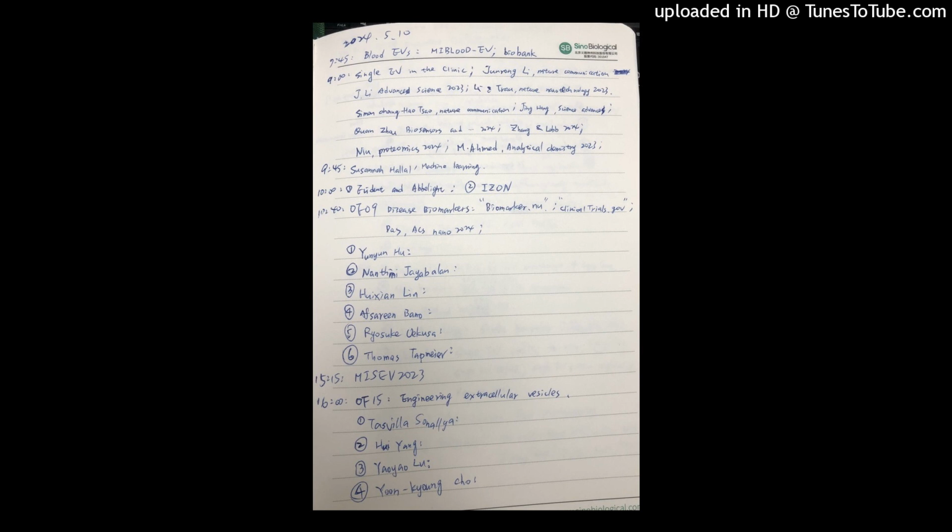Should I do it by size? So I'm using size exclusion. It could also be a combination with density gradient and centrifugation. You could also consider charge. It could be whether you need an anion exchange solution for that, or whether you need to go for specific surface markers. It could be using antibodies or certain lectins. It could be by beads, but also precipitation.